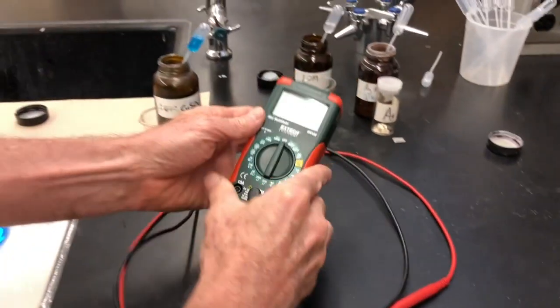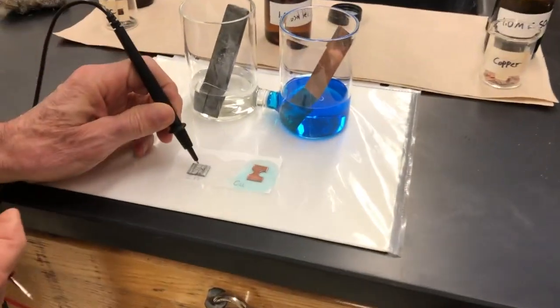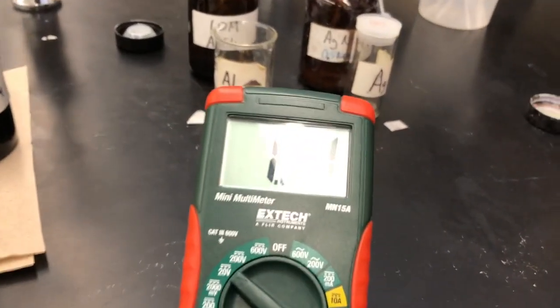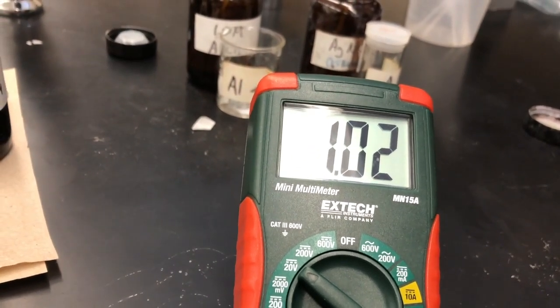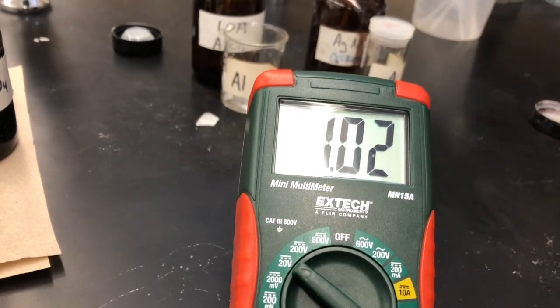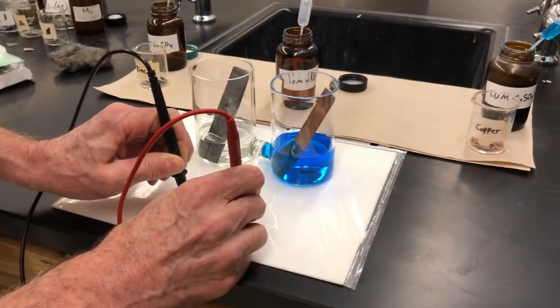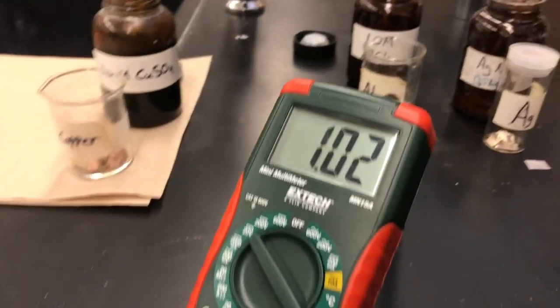Then we'll get a voltmeter and turn it to volts. As before, we will connect the black electrode to the zinc and the red electrode to the copper. And we get about 1.01 to 1.02 volts this time. The voltage is pretty close to the same — it varies a little bit depending upon how good a contact we can get. And that is the potential of this cell: 1.02 volts.